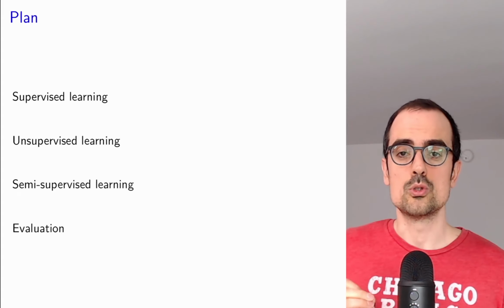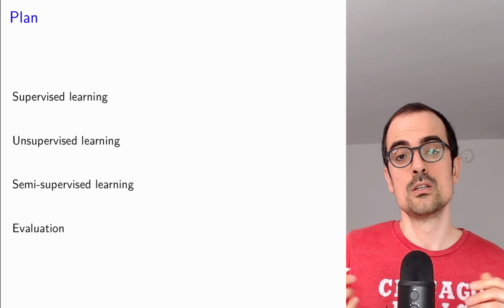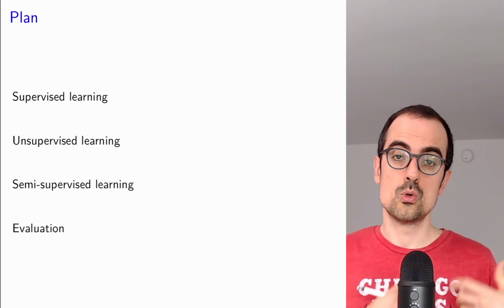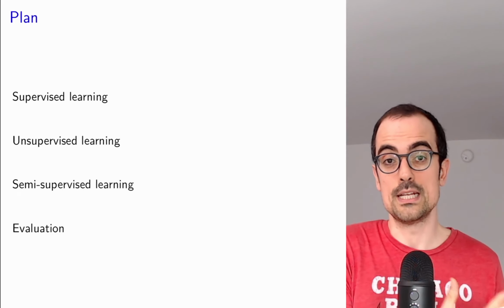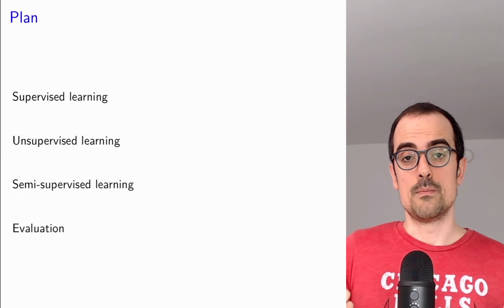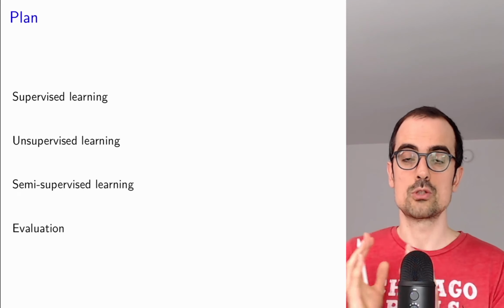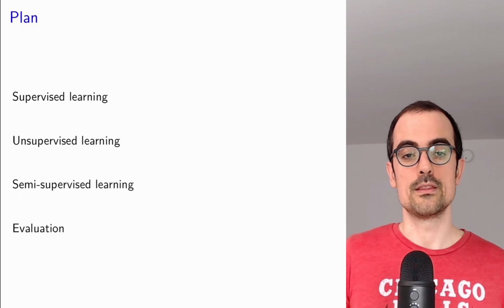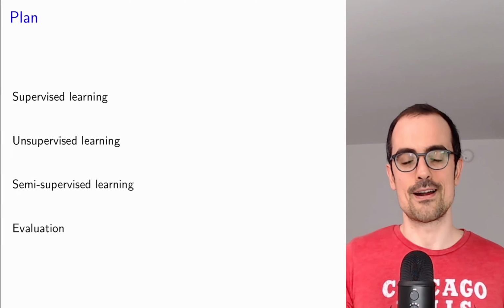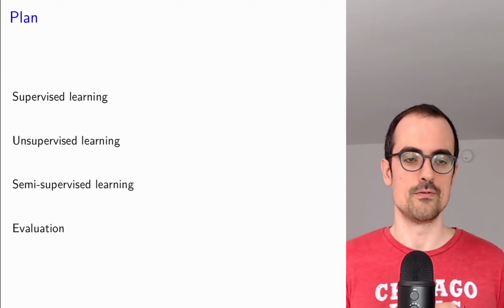But now what I'm going to talk about is how we managed to apply deep denoising to enable the visualization of those dynamics. As often happens in the real world, we had to apply different strategies until we could make this work, and they actually used the two main paradigms for deep denoising that we explained in the previous videos.